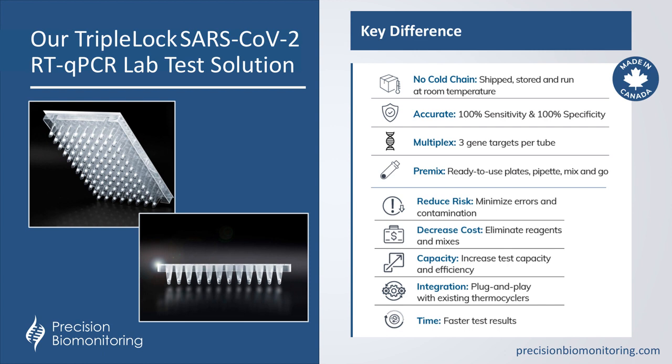So this gives you some assurance that a human sample was collected, that the extraction actually did extract human RNA, and that there wasn't any detectable inhibition from the sample itself.